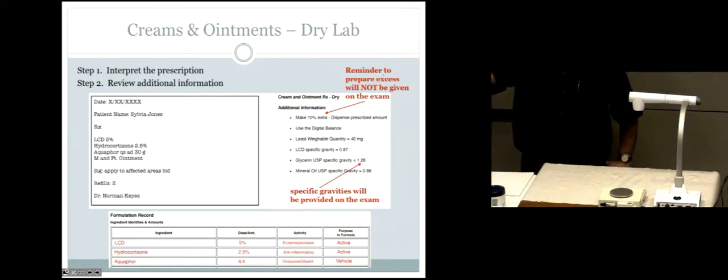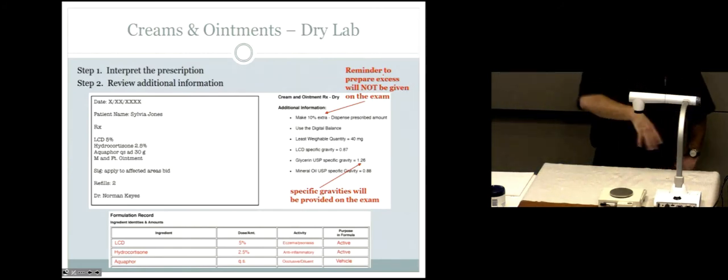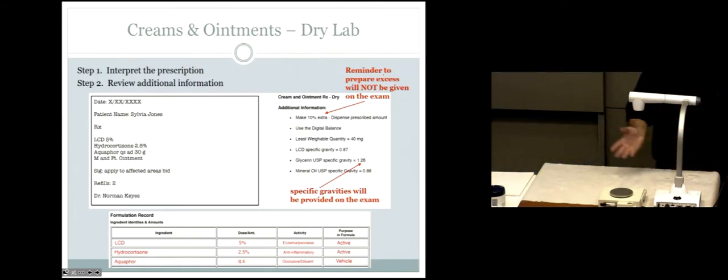It's not a solid, it's a liquid. So can you weigh a liquid? Yes, we did that before, right? But that's a big pain in the butt, so we don't want to do that. I've given you the specific gravity so you can convert the weight to a volume so you can easily measure that. That's where the specific gravities come into play.